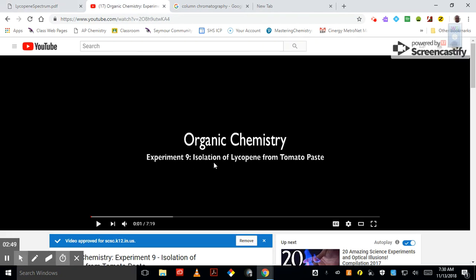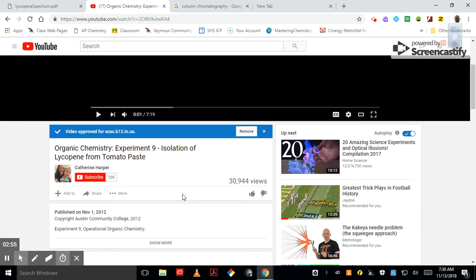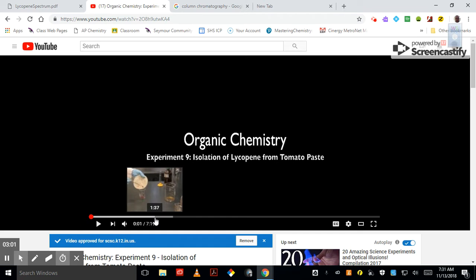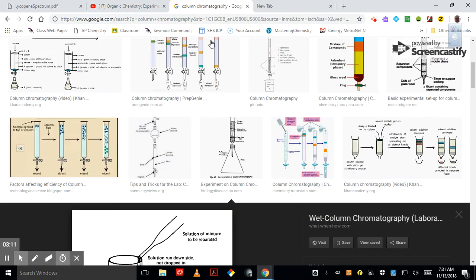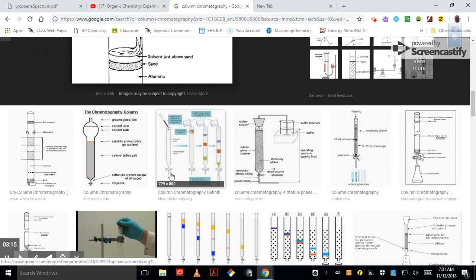Here is experiment 9, isolation of lycopene from tomato paste. It's only a 7-minute video. I highly recommend you watch it because this person goes through with you pretty much what we're going to be doing. They do a couple of steps different than we do, so don't write down all of her steps because ours will be slightly different.